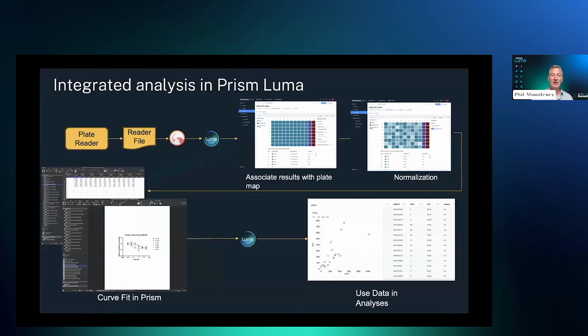the Prism pie here is that in our adaptive workflow piece, we're going to add some extensions, as I said, and task types that allow us to launch Prism. If you think about the demonstration I just showed you, what we're actually generating here are plate maps. So it's known entities in known locations in wells. It's concentrations of those. We already have Lab Connects, which you can attach to your Envision or any of your screening detectors and pull that across.